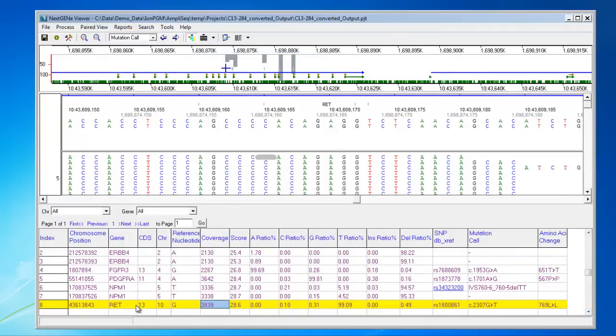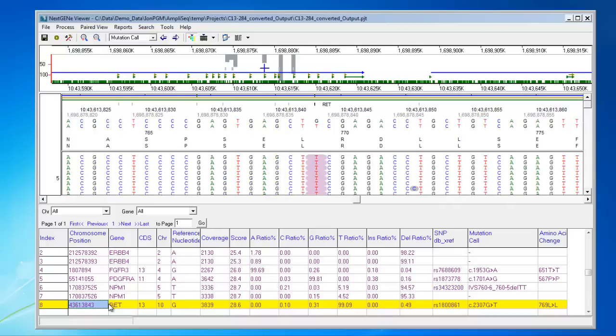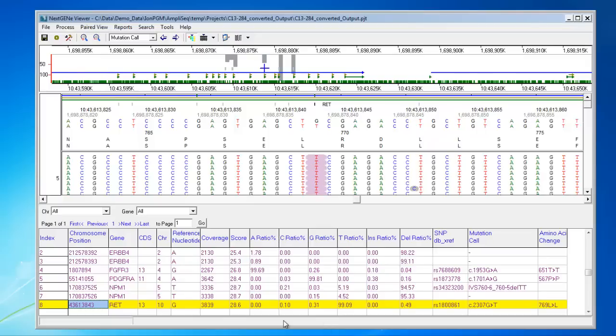In the report, you can click on any row and be directed to that location in the viewer. In the viewer, mutations are highlighted in the aligned reads. The purple highlighting indicates it's a reported variant that's in the dbSNP database. Novel variants are highlighted with a blue background.